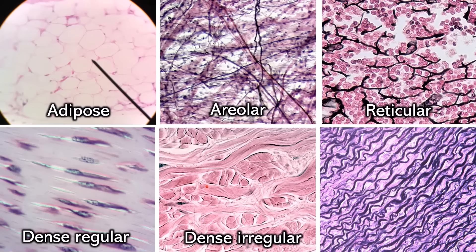Over here, this type of tissue is not very common, and all the examples I have ever seen tend to look pretty much like this. You're seeing wavy elastic in the foreground and in the background it's over a bed of pink collagen fibers. This is elastic connective tissue — not to be confused with elastic cartilage, which is an entirely different tissue. If you want to learn about cartilage, I'll pin a link in the comments; I have a special video just for cartilage.